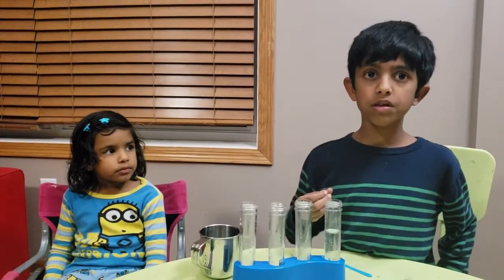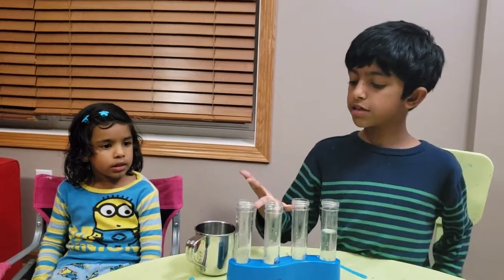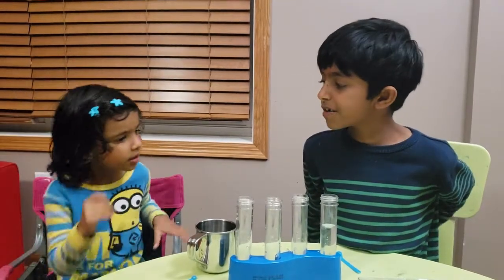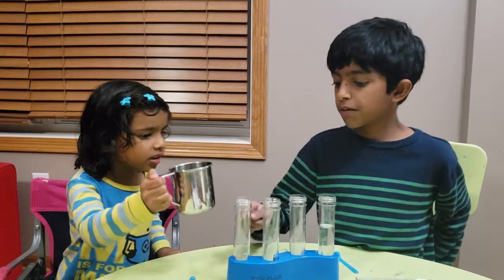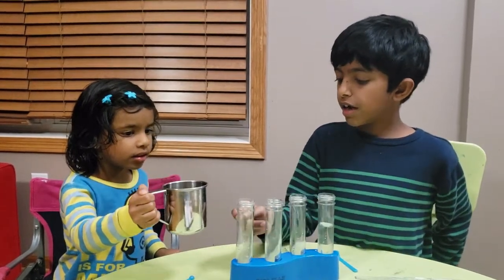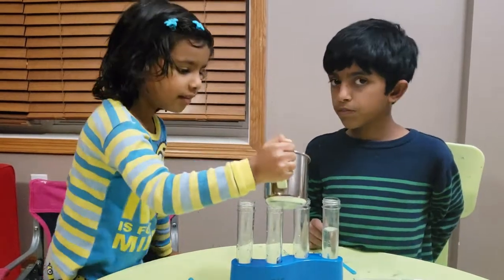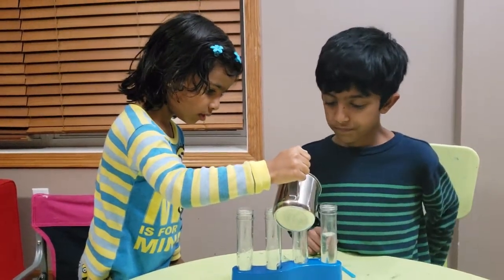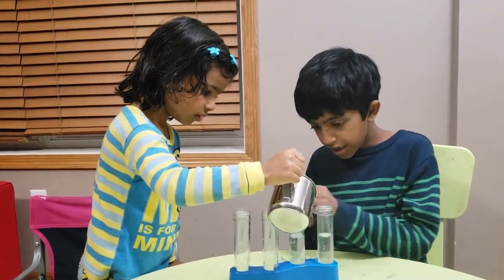In the first test tube I already added vinegar, and in the rest of the test tubes I'm going to add water. Ava, can you pour the water in there? Like probably over here, and over here in this one, and over here in this one too. A little more, a little more, and stop.